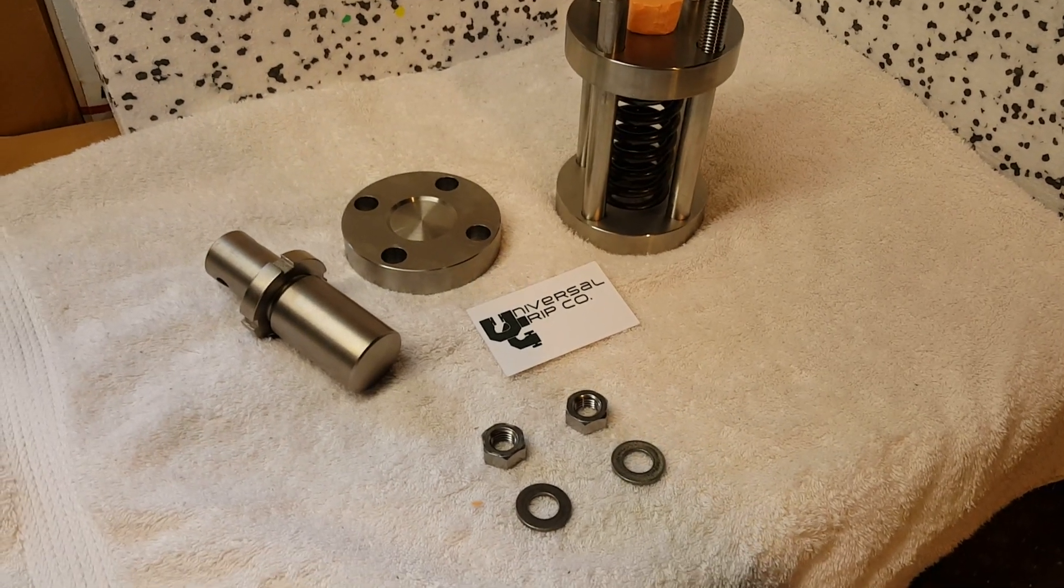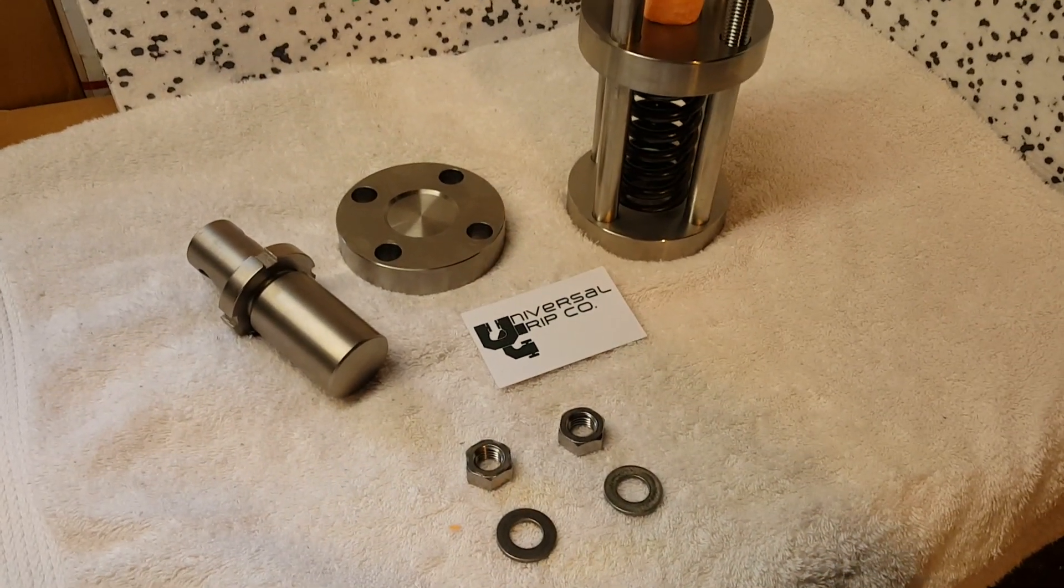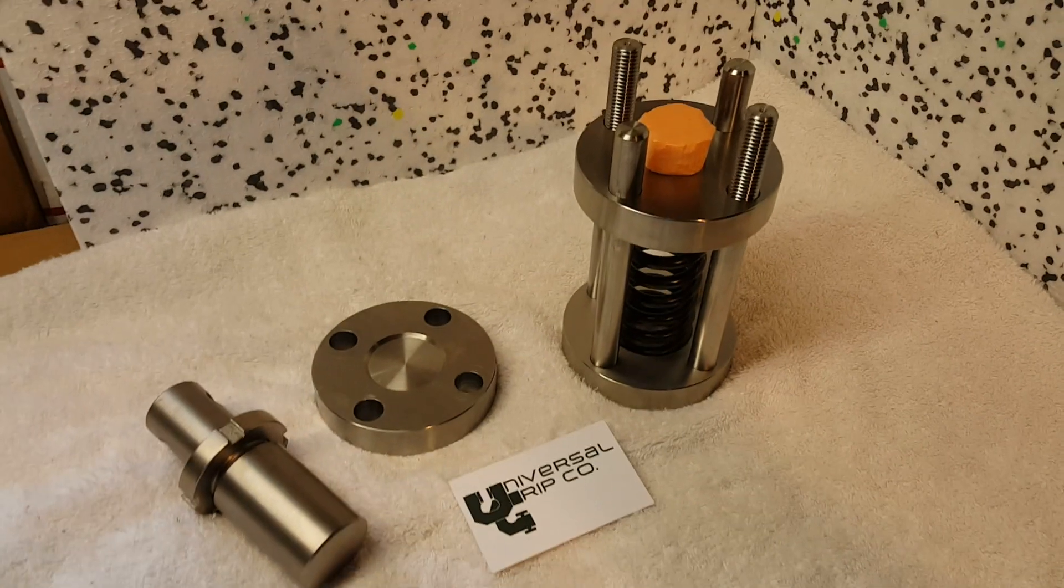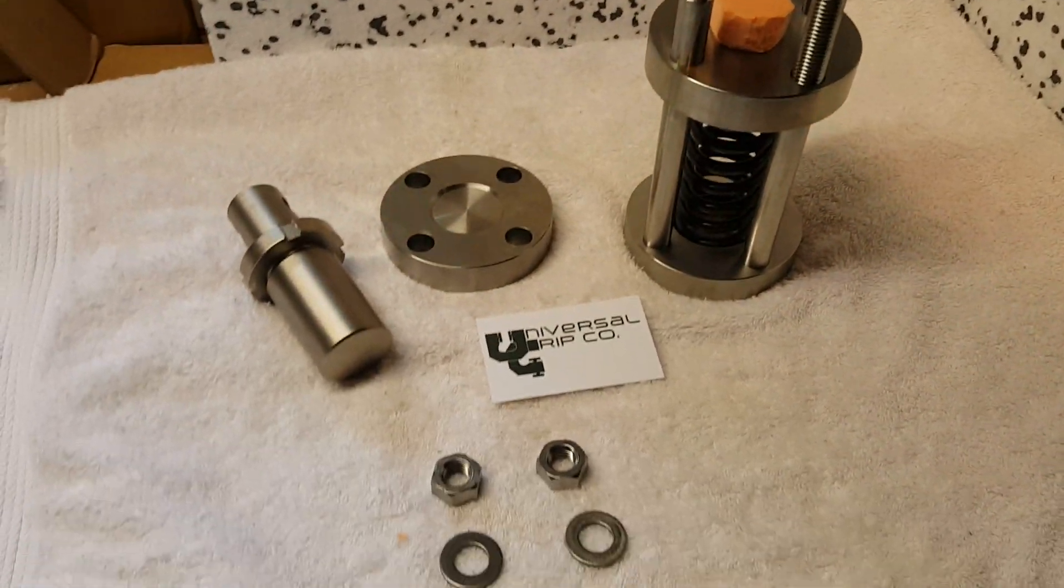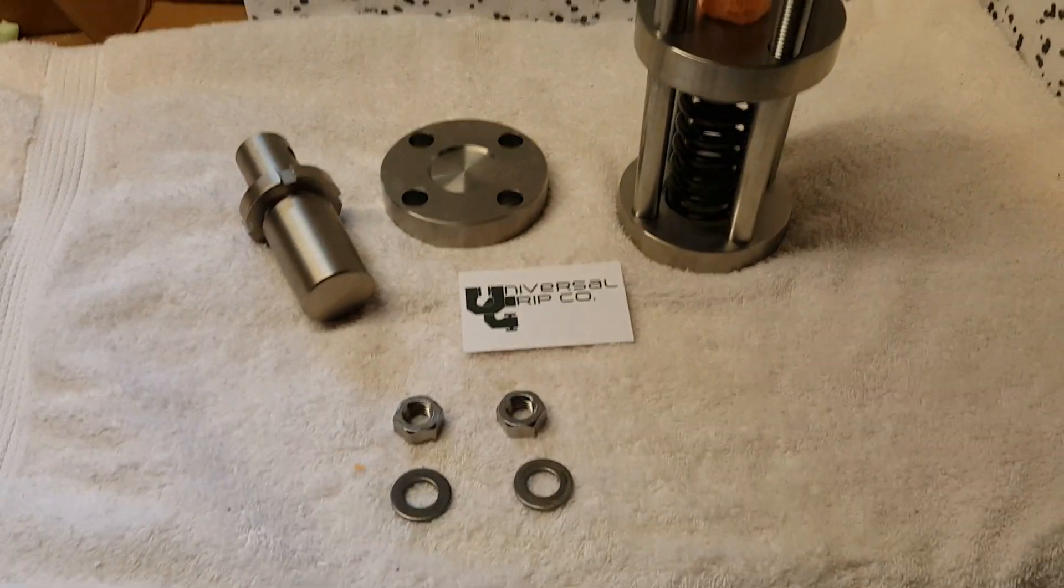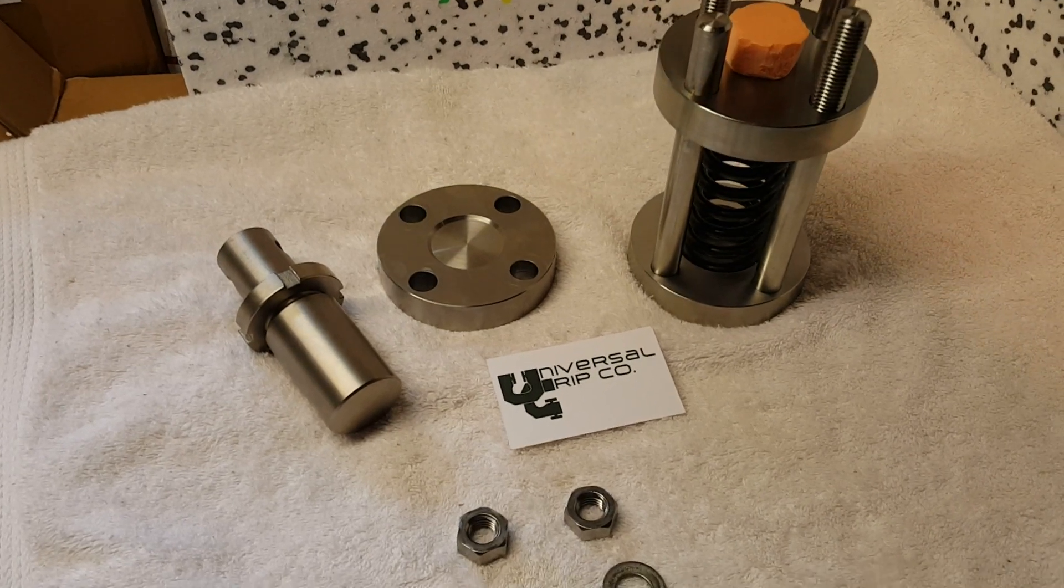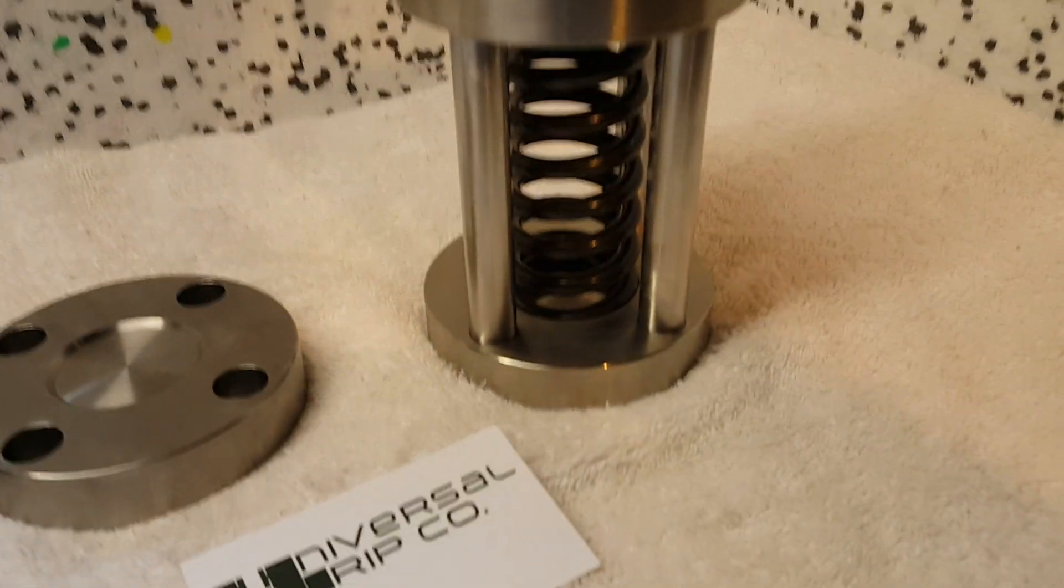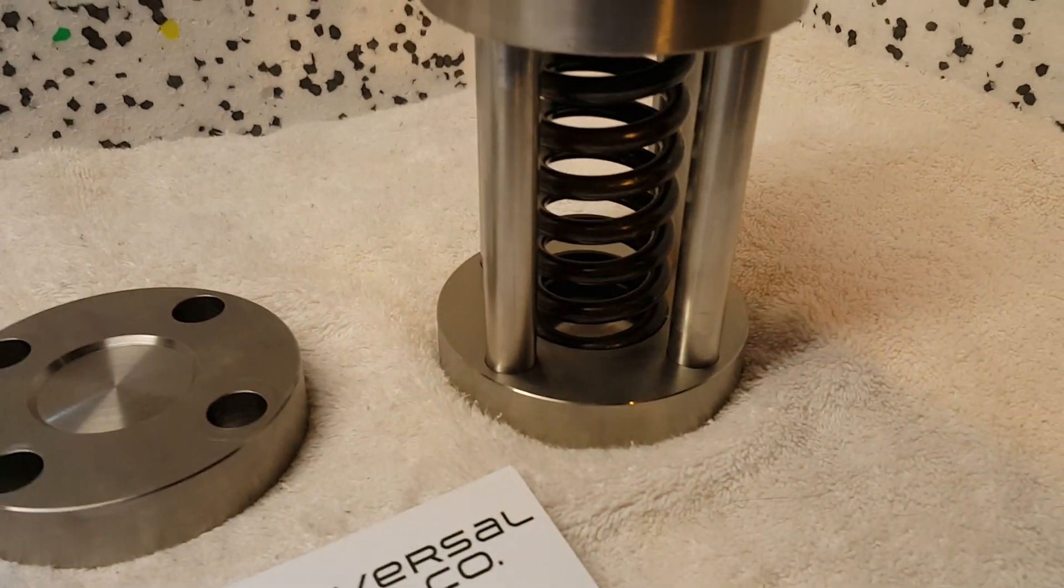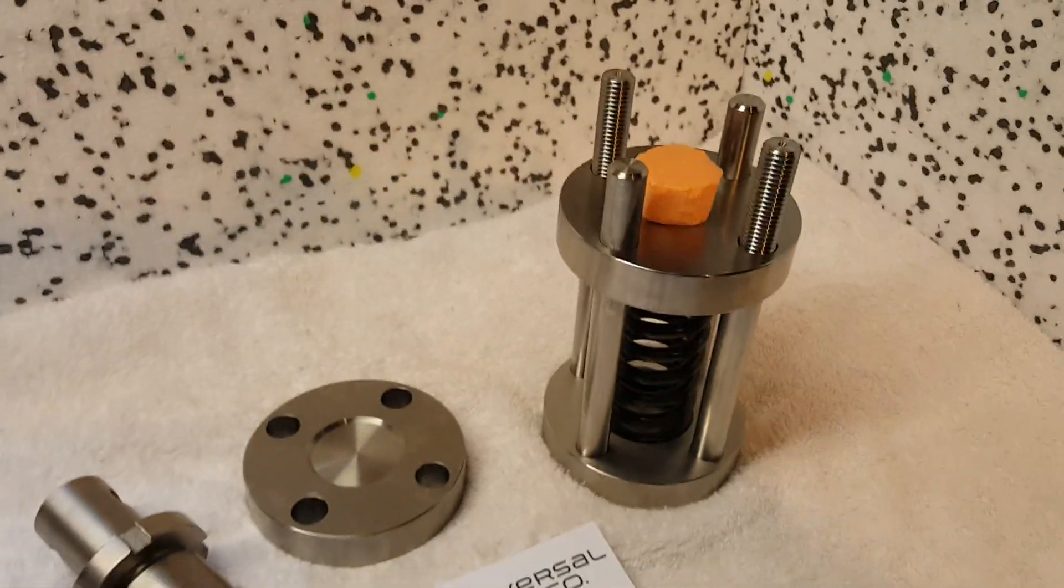Hello everyone, today we're showing the ASTM D395 method A compression set fixture. This is used for testing rubber and elastomer. The idea is that the spring maintains a constant amount of stress onto the sample.